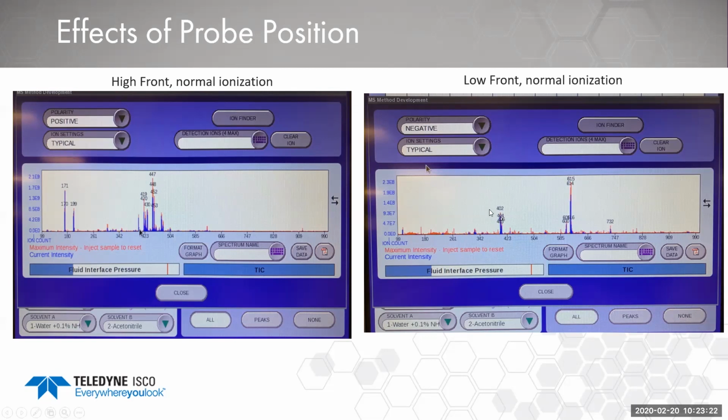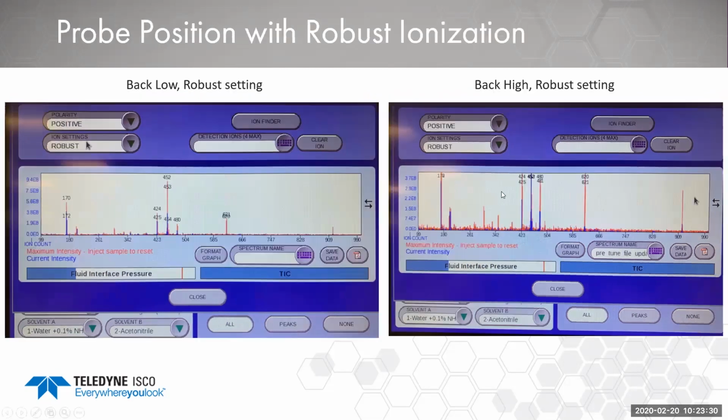If we have the standard setting, which is what I was calling low, but it's really the standard default, we may be losing a lot of ionization and a lot of material because of the way it's being entered into the source. We can also change settings.